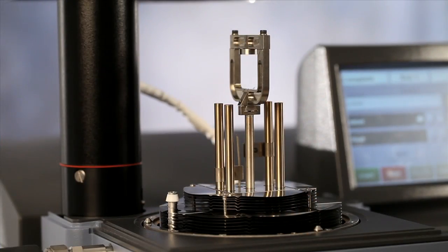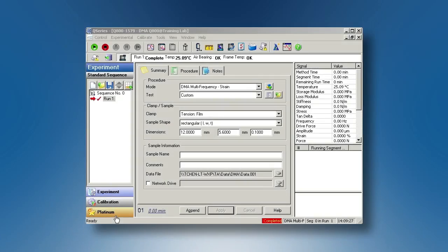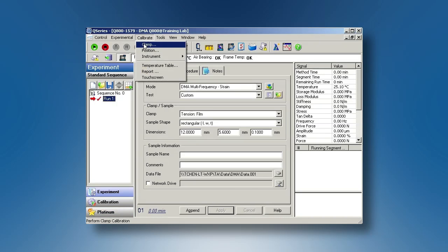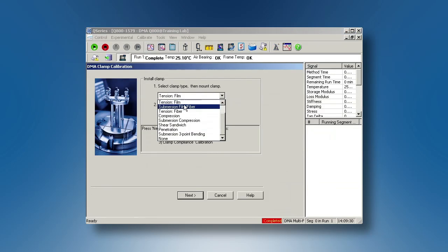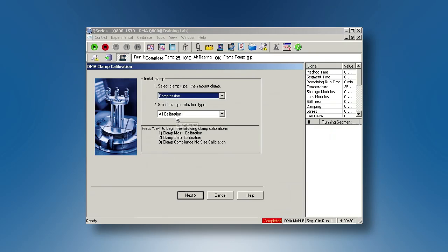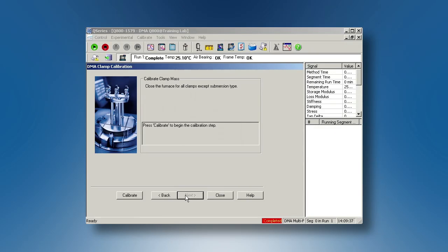From the control software, go to Calibrate, Clamp, choose Compression, All Calibrations, Next. Then click on Calibrate.